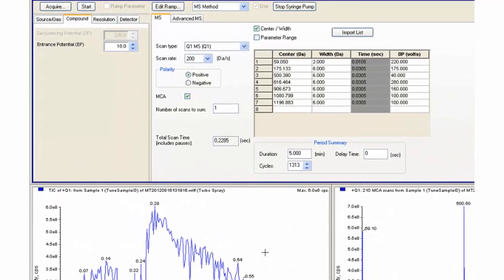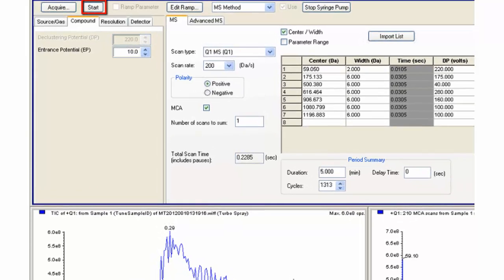The Start button can be used when checking to see if data meets certain criteria, such as confirming that the TIC signal is stable, and saving this data is not critical.